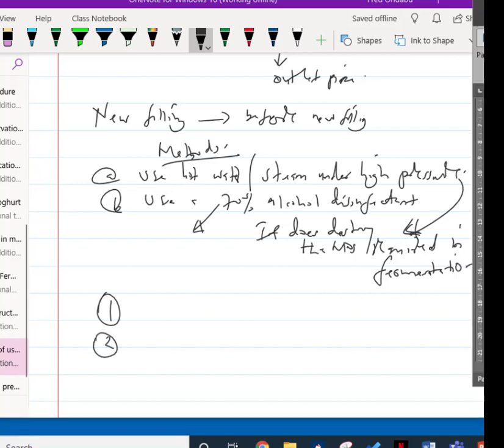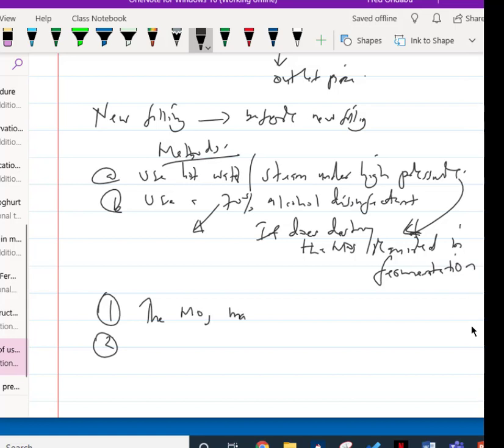One thing is that if microorganisms manage to get into the vessel, they may compete with the organisms in the culture, the ones you require for fermentation, reducing the yields.